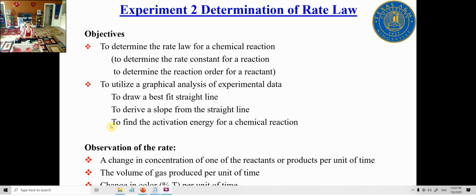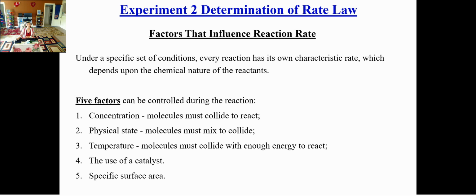So based on your observation, what you are going to find is the temperature change and concentration change of your reaction or reactant per unit minute. You are going to observe the volume of gas produced per time unit. And then you're possibly going to take a look at the color change per time unit. So that's what you are essentially going to be discussing.